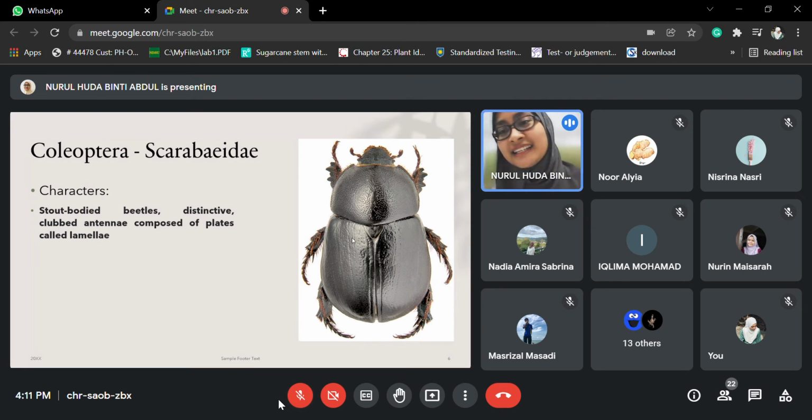Before this we have never come across the word scutellum, right? I never said it to you. So here is actually the part, as you can see above here. I'm not sure whether you can see my mouse arrow.